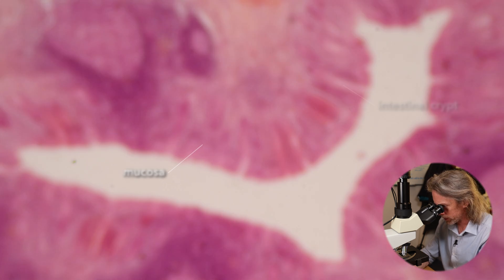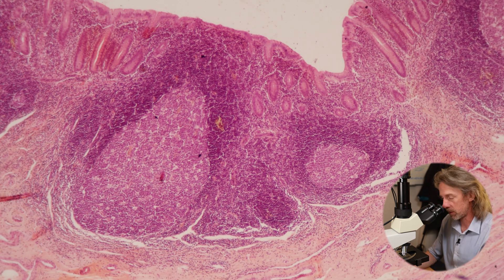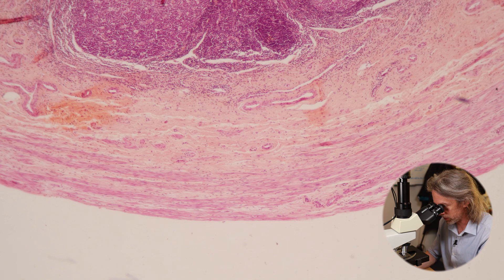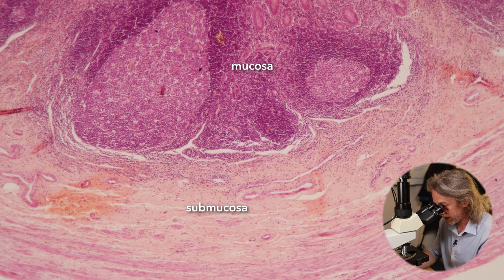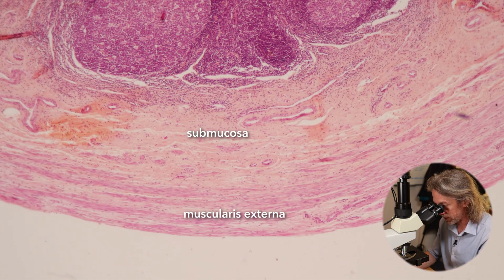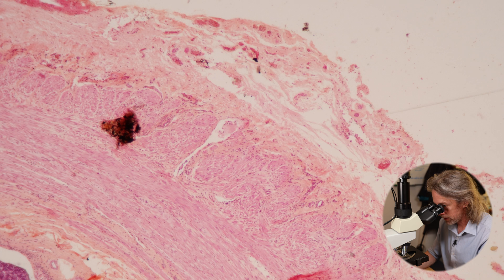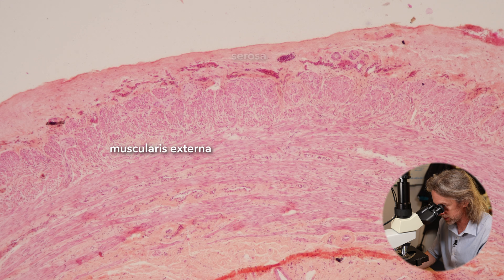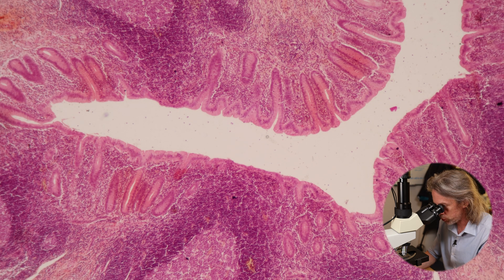We can see things that look like intestinal crypts, and we can see big purple spots similar to something we saw in the small intestine. There are also layers of muscle. So we are seeing mucosa, although it's a little different, then submucosa with blood vessels and nerves, then muscularis externa. Swinging over, we can see the layers of the muscularis externa and the serosa — the connective tissue covering — which has blood vessels and fat. Let's start on the inside and zoom in.